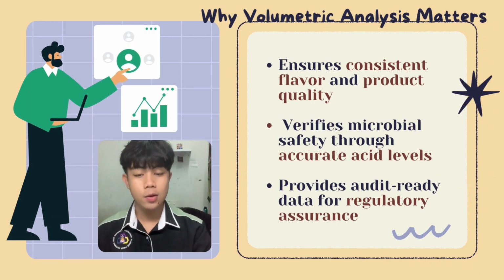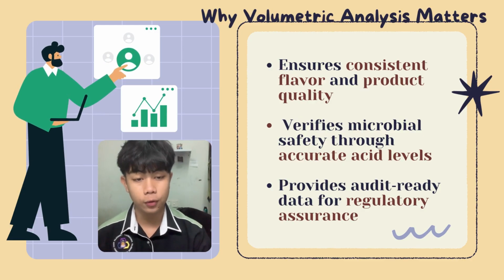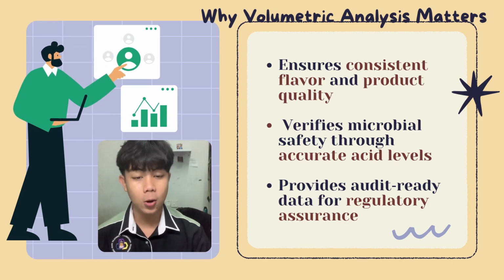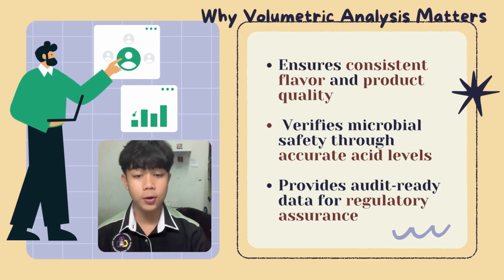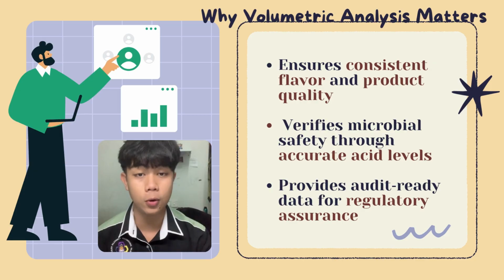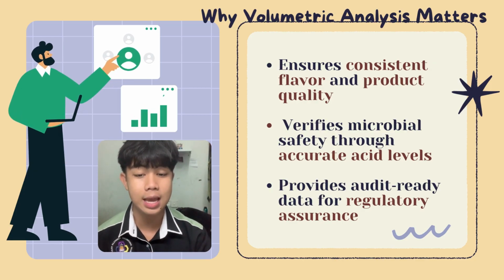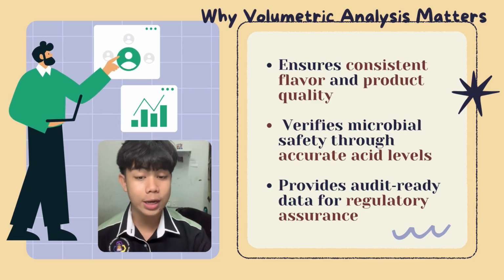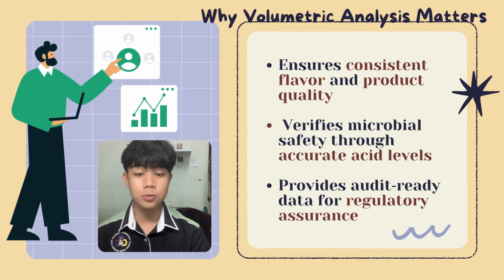In summary, volumetric acidity analysis underpins every stage of quality control, delivering consistent taste, proven safety, optimized shelf life, and data-driven process control. It also drives cost-effective production workflows, supports research and development of new formulations, enhances supply chain transparency, and generates the audit-ready documentation required by regulators to ensure compliance and to maintain consumer trust.